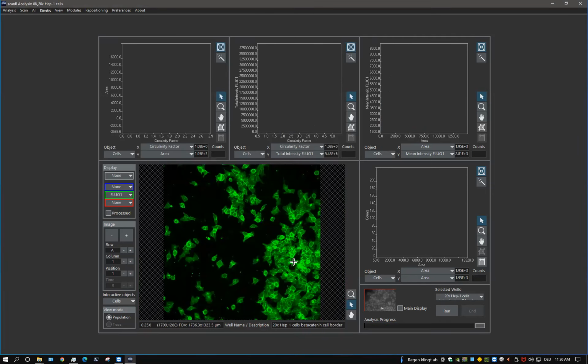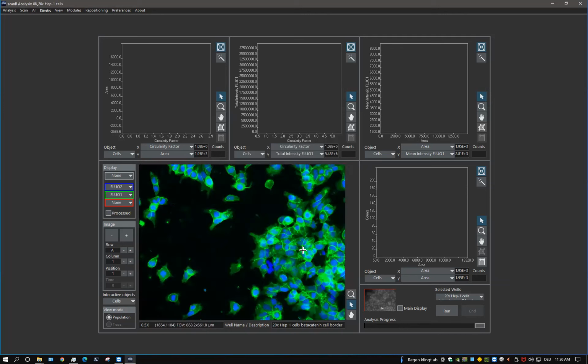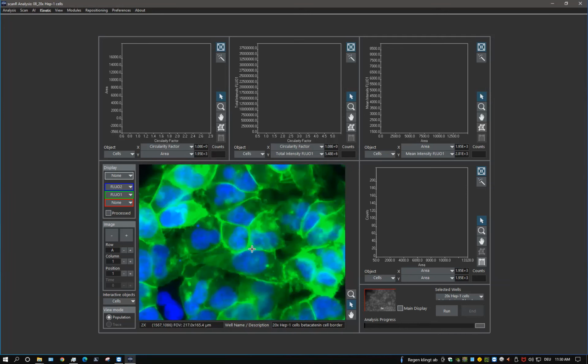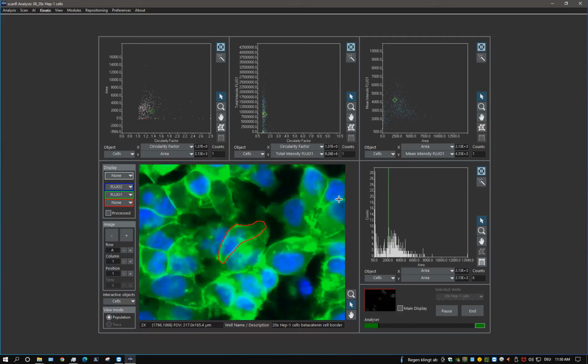Again in 20x magnification. I think here I even have a nucleus marker, which is good for us, for the human eye, to have a better reference here. Let's run the cell detection network here. Wait a few seconds, and right, here it comes.